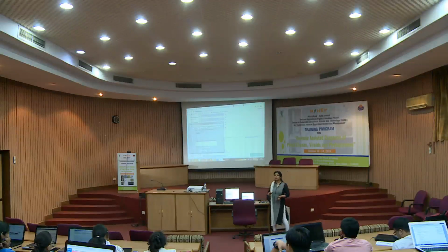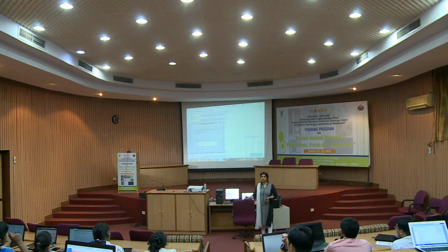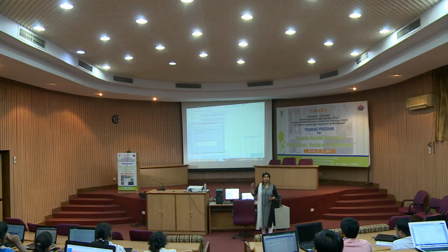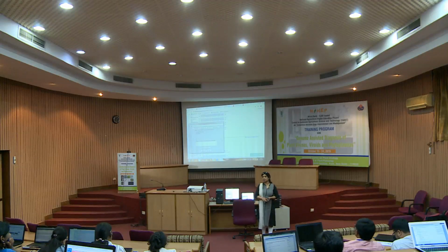You just write down these softwares and practice it once. You can start with 1 or 2 genes, pick any sequence online, and try to make it up to a flat file. See wherever you face any problem, then you can get back to us. But try it today only, otherwise you will forget, because there are multiple softwares and multiple steps. If you have not written it stepwise, you will get stuck at some other place.